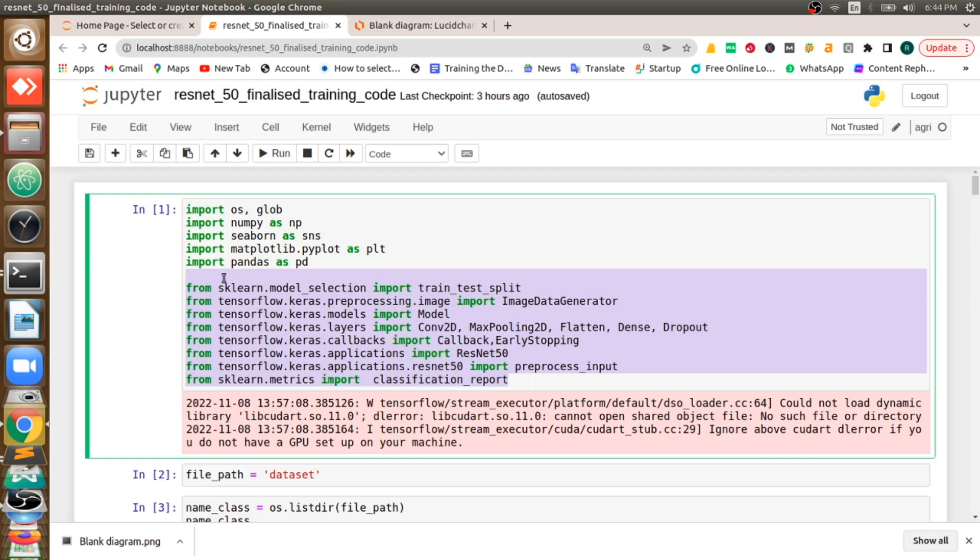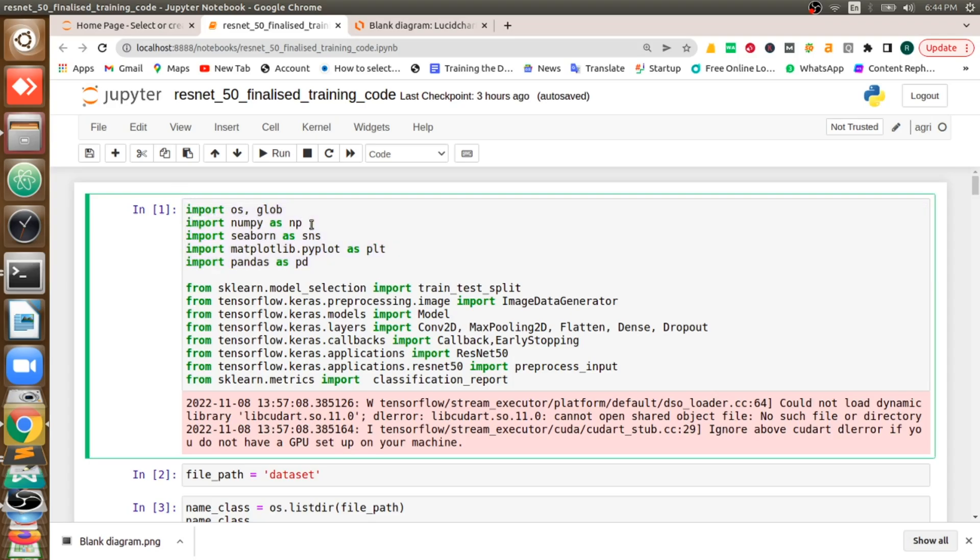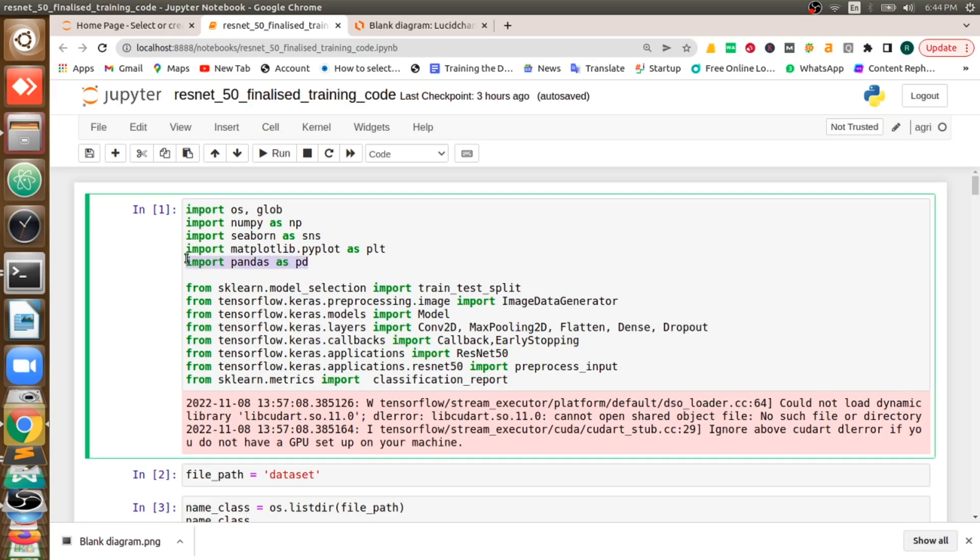All these libraries like NumPy is used to work with arrays, Seaborn is used to work with plots, Matplotlib is also used to work with plots and even to display the images. Pandas is used to import any dataset or create any dataset.